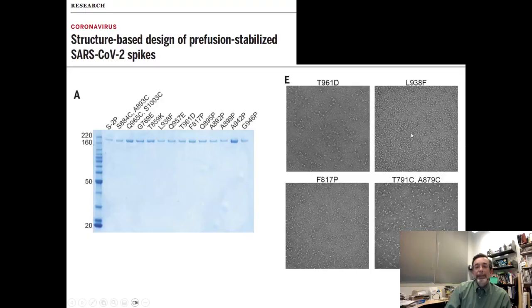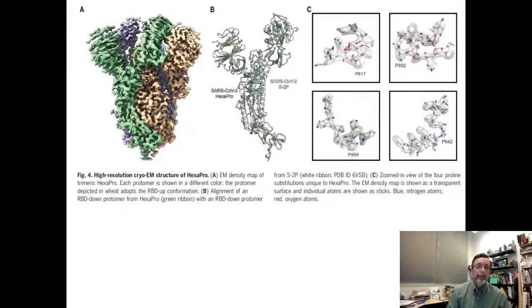They're showing you some of the cryo-EM pictures of all the molecules sort of jumbled around. This is where the cryo-EM takes its two-dimensional slices from before putting them together. And they're showing you they tried a bunch of different mutations. Look at what they tried and why, and what worked best, what didn't work. Be able to interpret those kinds of figures.